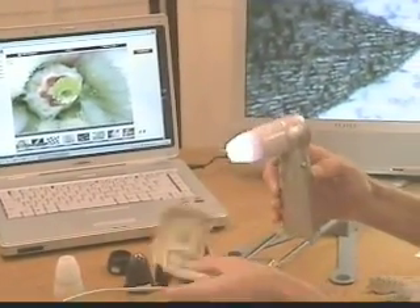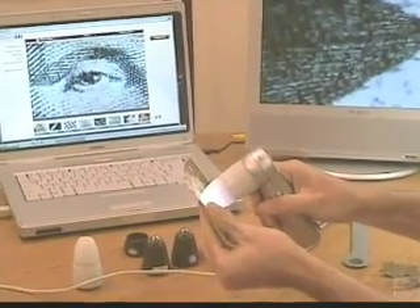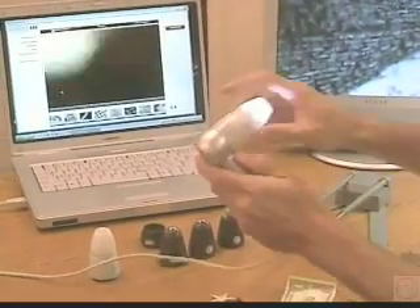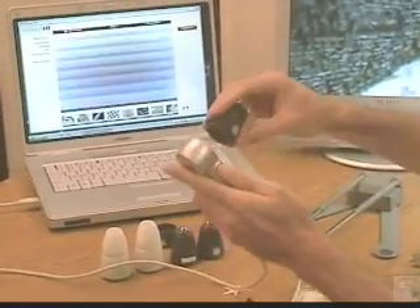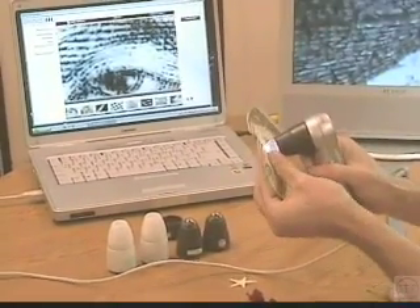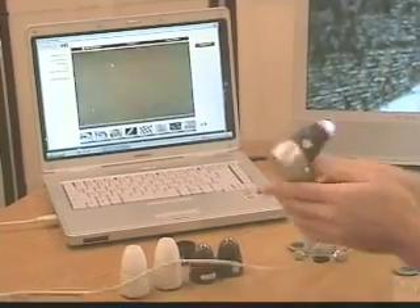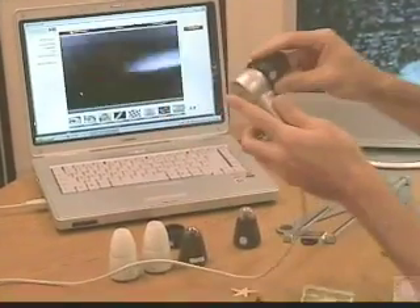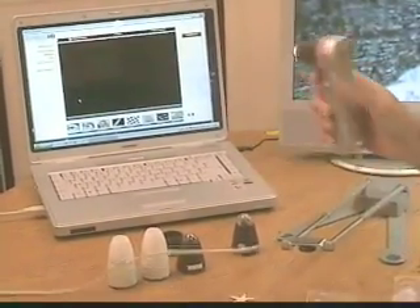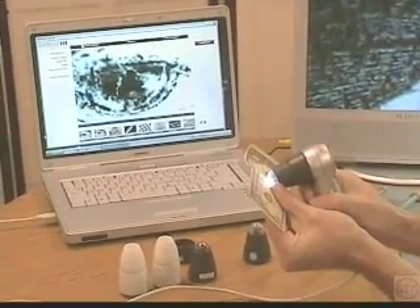I'm going to take a picture now of the eye — George Washington's eye on the surface of the dollar bill — and I'm going to change lenses to the 100x lens, and now I'm going to take a picture again of the eye so you can see the difference in the magnifications available. Then I'll go to 200x and take a third picture. The highest lens available is 400x for both the ProScope and the Scope on a Rope.